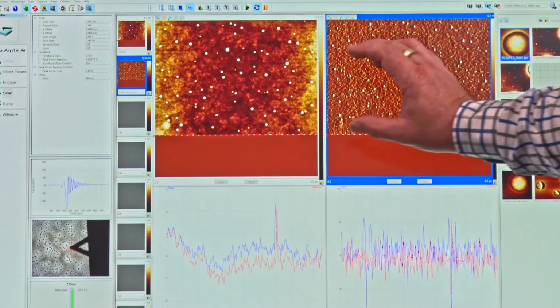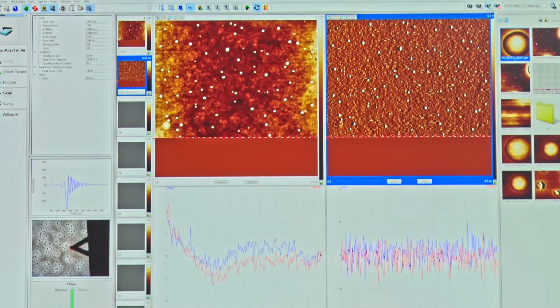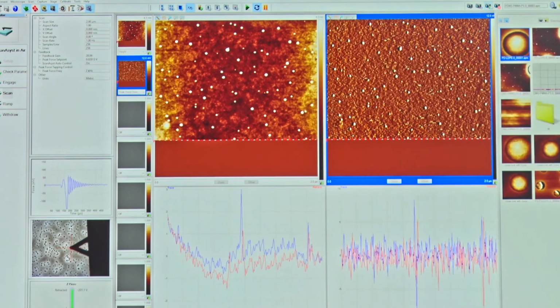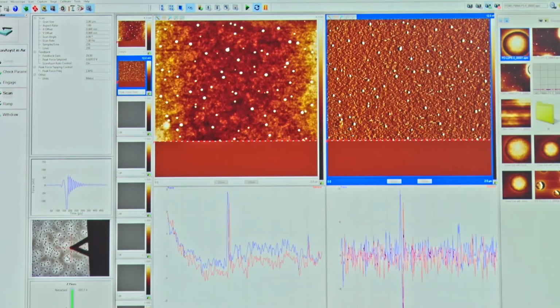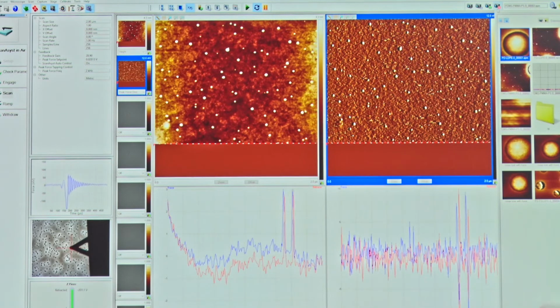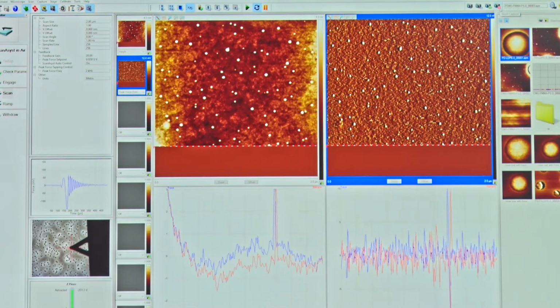We can do a capture now. Maybe the information that we need is already displayed on the screen. We don't need to wait for it to finish. We can press capture now, which will capture just this part of the information that we've already scanned. And if we've enabled something and we want to stop that, we have this cancel capture or abort capture here.